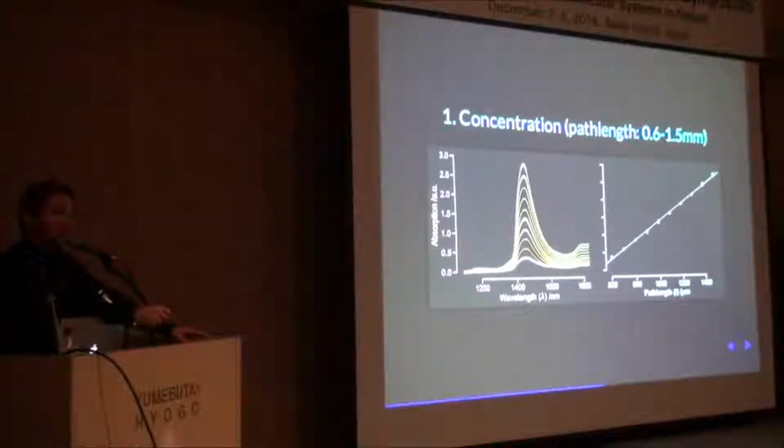I cannot say never, but some people are working with solid samples, and different, but the range of concentration in most cases is not too wide. In some respects, this is too wide, too unrealistic in terms of solutions. It's realistic in terms of pure water, but in terms of concentration that you can normally encounter, it's not realistic. It's over-exaggerated just so that you can easily appreciate that the first decimal is where path length and big concentration changes are happening.